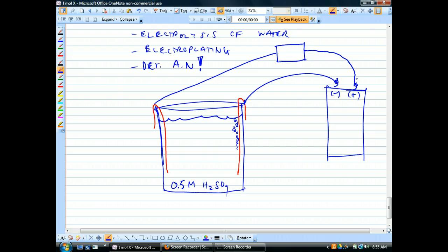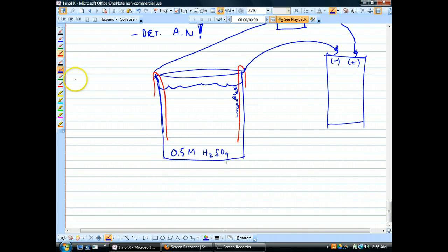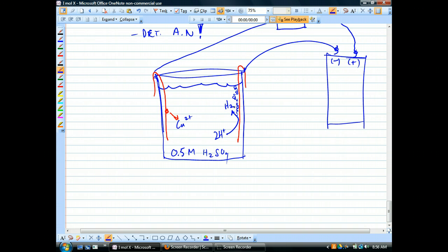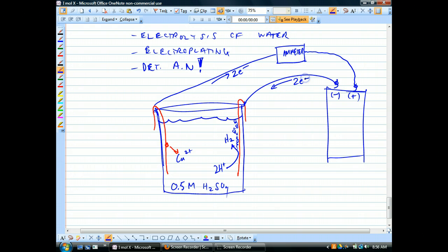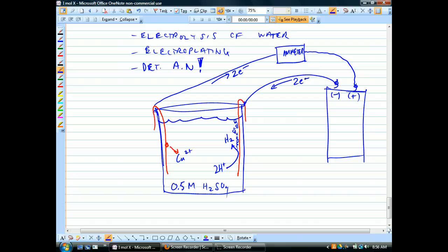This is reading amps via an ammeter. The reaction here is copper atoms from the anode become copper 2-plus ions, while on the other side hydrogen ions become hydrogen gas. The key point is that every time a copper ion pops off, two electrons go through the circuit. For every single atom that comes off, two electrons go through - it's quantitative, it has to be that way. That is one of the key points of this technique.